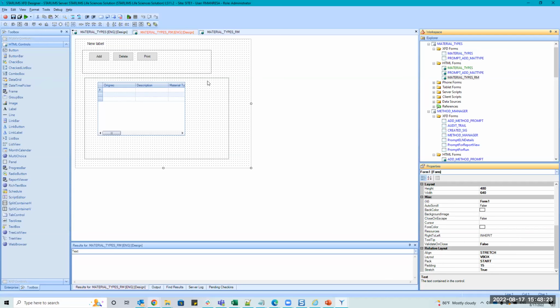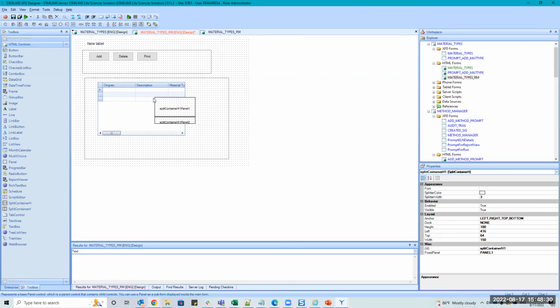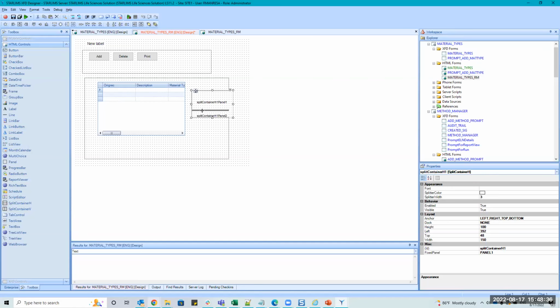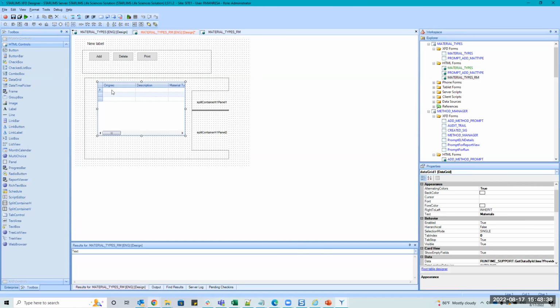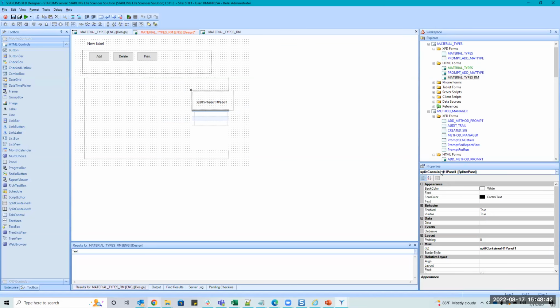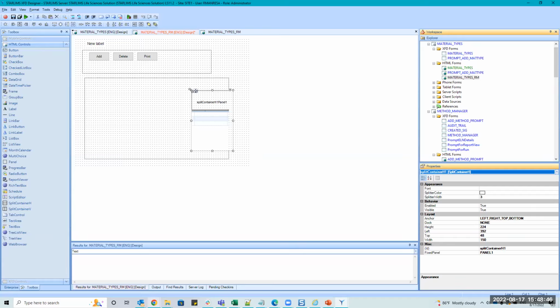Relative layouts everywhere with panels everywhere. I use a lot of panels, and then a lot of split containers, which are just a control that has panels. This one's a little funky to play with, but you know, I would add this in here. I'm clicking on it, and then I'm going to the splitter control itself so that I can move it around.